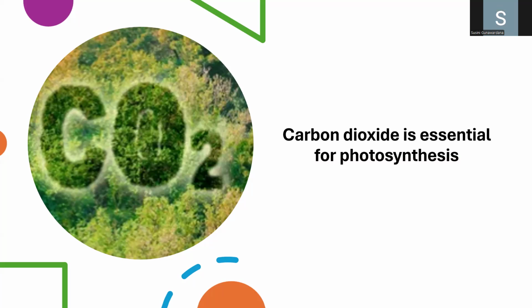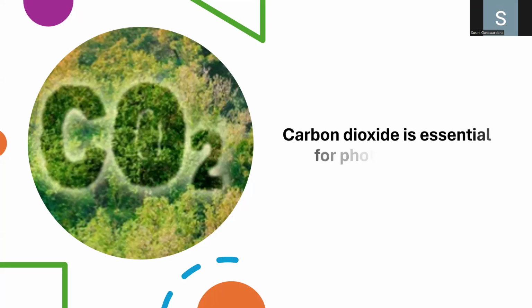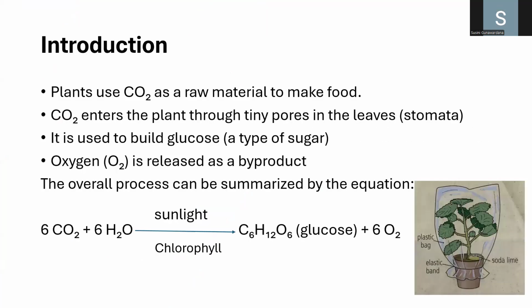So today we are going to check whether carbon dioxide is necessary for photosynthesis. As you know, plants use carbon dioxide as a raw material to make food.